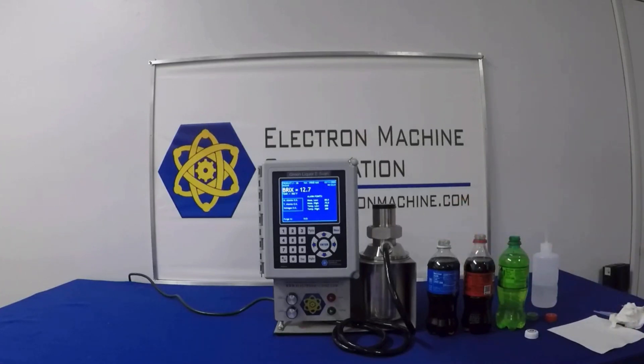So I hope you enjoyed this quick little look and another highlight of another product that the refractometer is of great use for. In this case, measuring sodas.